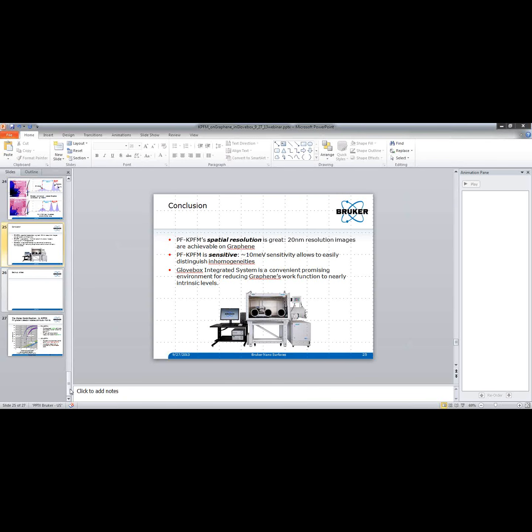And basically in that paper they had values in the 4.9, 4.8 range. So there are some error bars around all of these numbers. They're around 100 millivolts. So the absolute values are difficult to know exactly, but they're in that range.